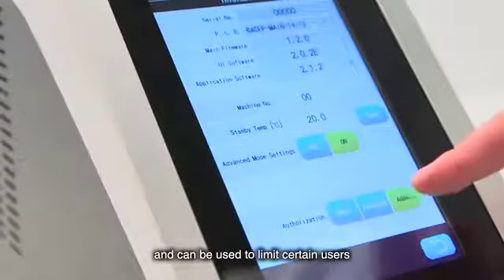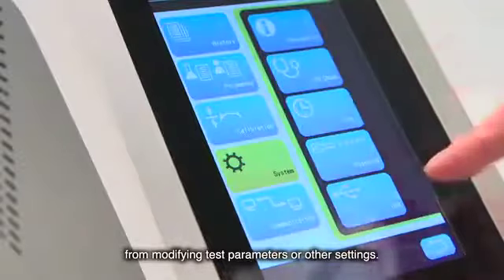Three access levels are prepared and can be used to limit certain users from modifying test parameters or other settings.